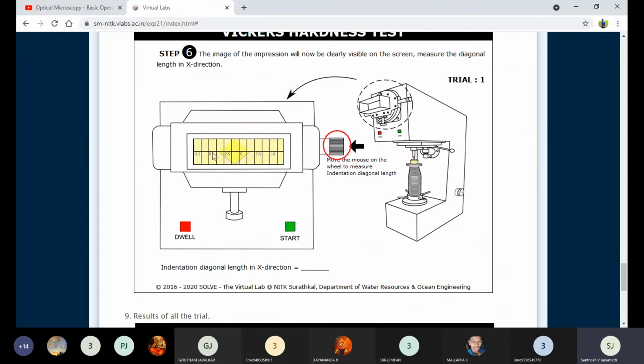Then this is horizontal. The next time, you can adjust the knobs. This portion now looks horizontal. Now you can turn this, and the screen will be vertical. Once it is vertical, this will also be vertical, then you can take the vertical lines. Once you turn like this, this will be horizontal. Hence this is d1 vertically. Whenever we take the values vertically, this is d1.